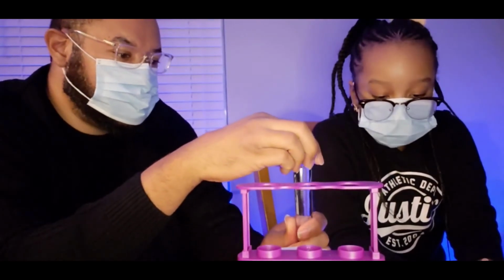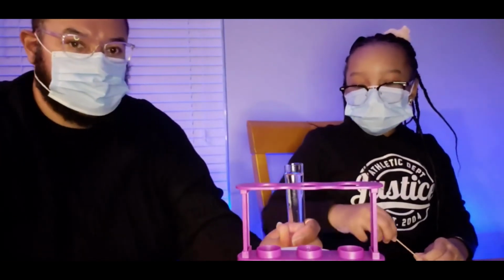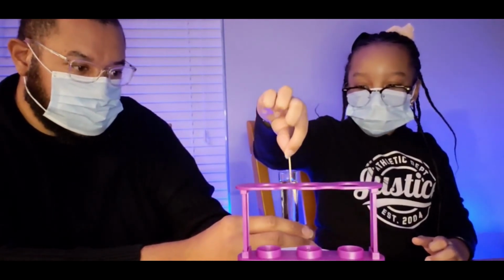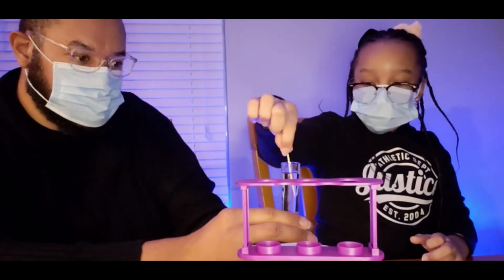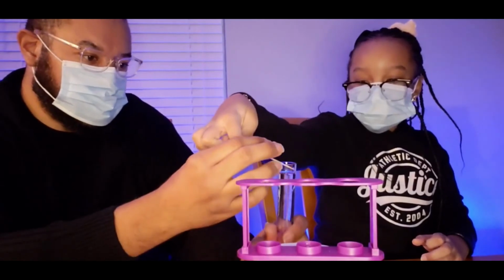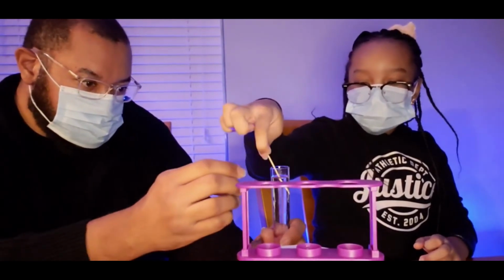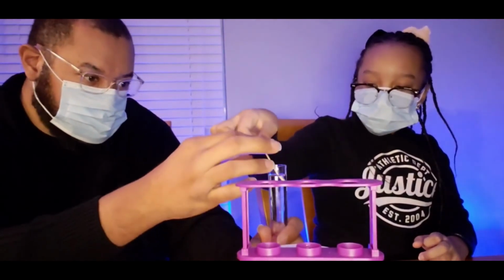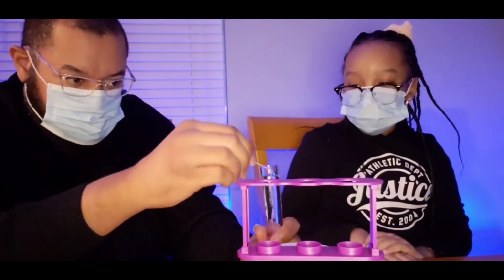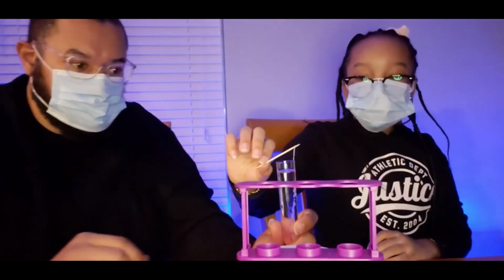I'm taking the top off. Get the toothpick ready. All right, toothpick is off. And you can dig in there and get some of those strands. There you go. You pulling some out? Yeah. Let me help you out. Here, you can hold it. Let me pull it all the way out.